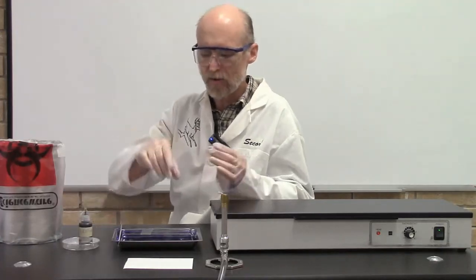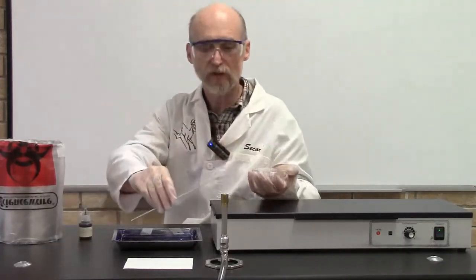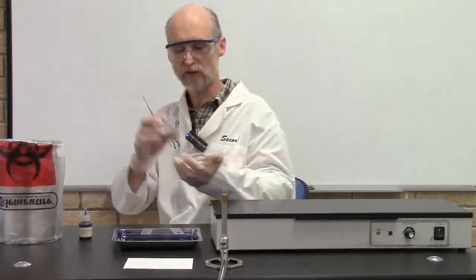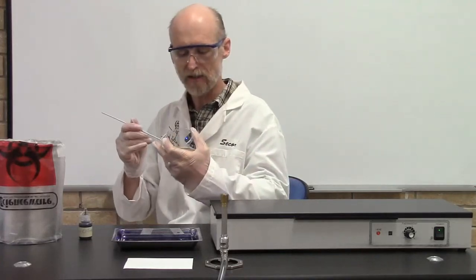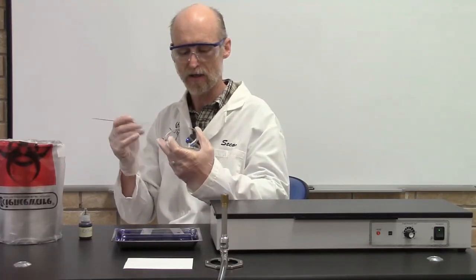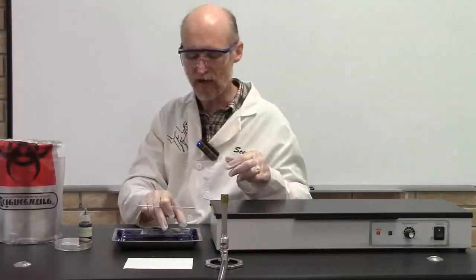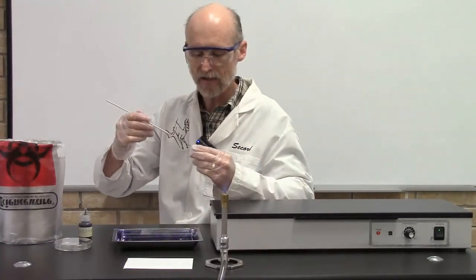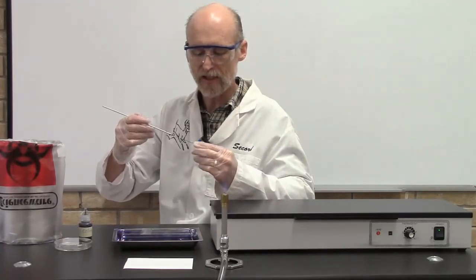Next, we're going to get a culture of bacteria and we're going to stir them into the drop of dye. Let me flame my loop, sterilize it. I'll let this cool. I'll go in and get a nice sample of bacteria. And I'm going to stir these into the dye drop. When I stir it into the dye drop, I'm just going to stir it side to side, so I'm moving the drop laterally as I'm mixing the bacteria into it.